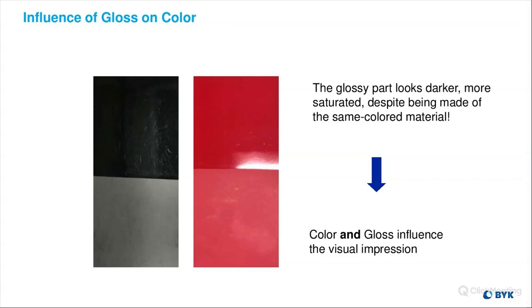It's a very nice tool for picking up these weird samples, or even in the injection molding industry. I know a couple places that use them to figure out, shockingly, how clean their injection molders are. So they'll take measurements of the product, and if the texture starts going down or diminishing, then that usually means in their process that their injection molds are getting dirty. And so that's a good indicator for them to use in their process. So it's got a variety of different applications. Yeah, that's a good tool.